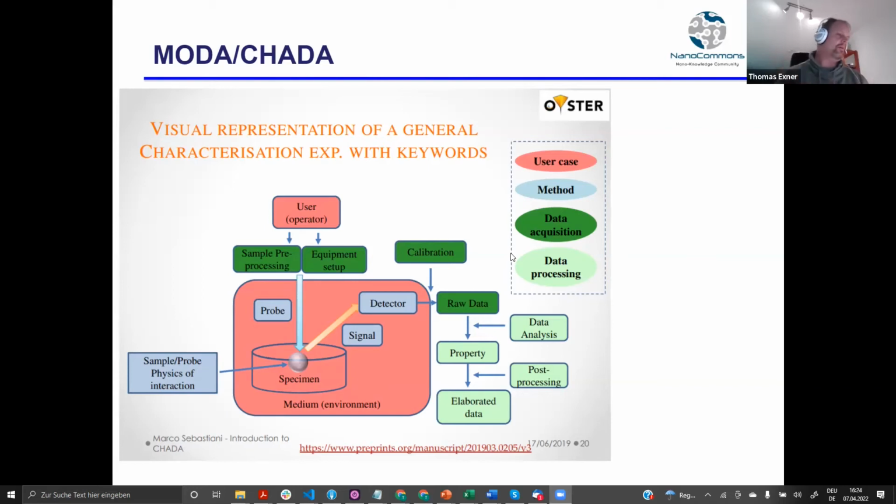And I think Martin already mentioned quite a lot of these, which could be the building blocks you have. That is in principle the first step: when you want to do something like that, you would look at the existing SOPs and try to figure out what you would need to build them.